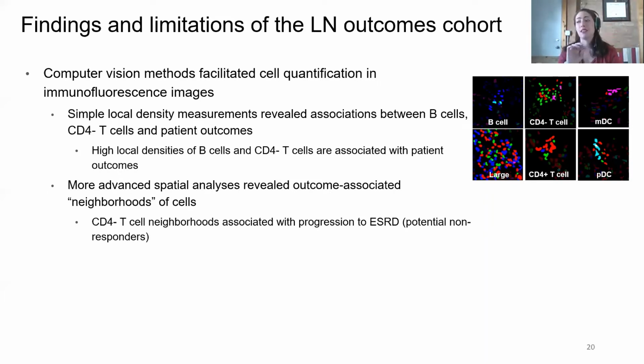And so that means that your ground truth is essentially corrupted. So there's some difficulty there, and there's also bleed through with the way this panel was set up between the CD4 channel and the CD11C channel. So you have some false positive signal in there that bleeds through from the CD4 as well. So it comes down to two factors, which is panel design and the morphology of the CD11C, and establishing the ground truth for these supervised learning algorithms.